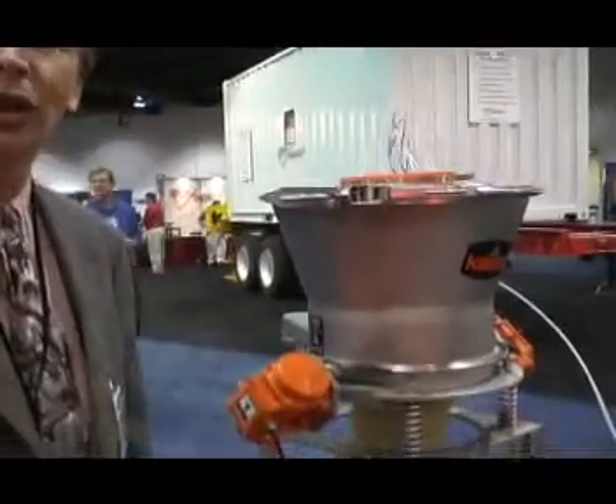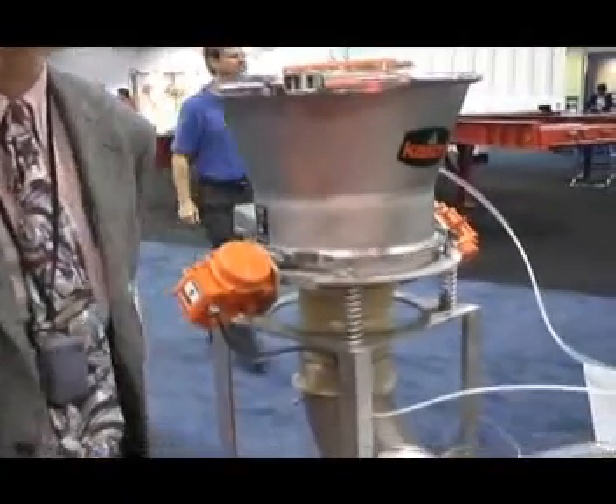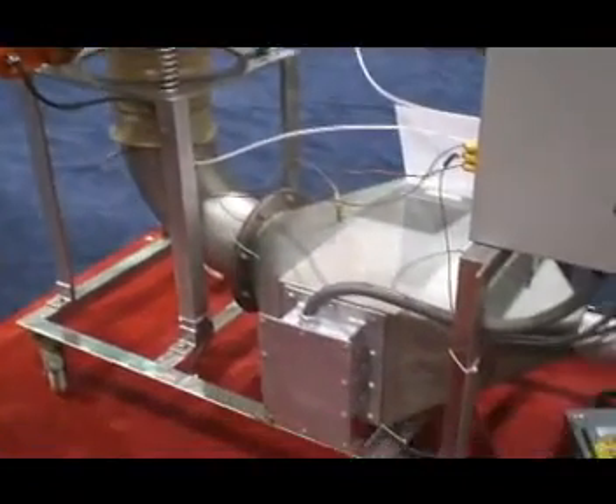This is the Kason fluid bed dryer. Kason offers a fluid bed dryer in sizes going from 18 inch in diameter up to 84 inch in diameter.